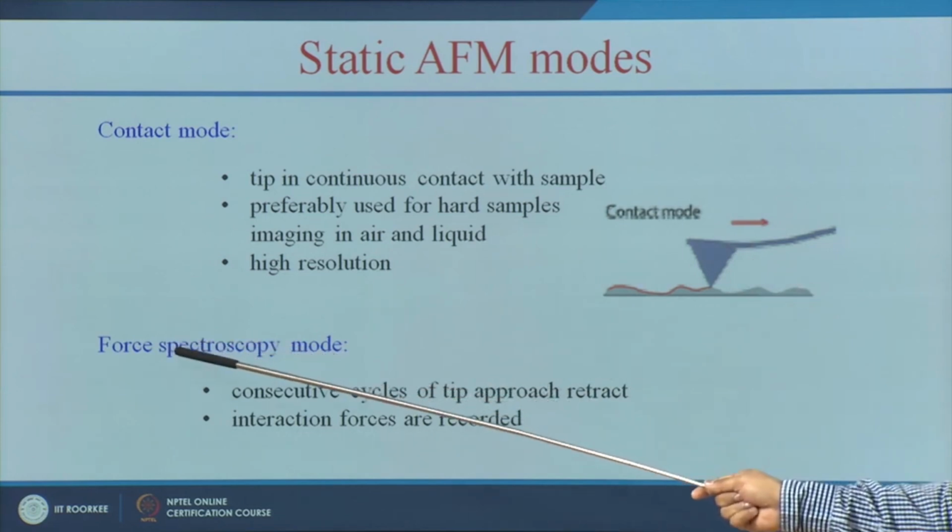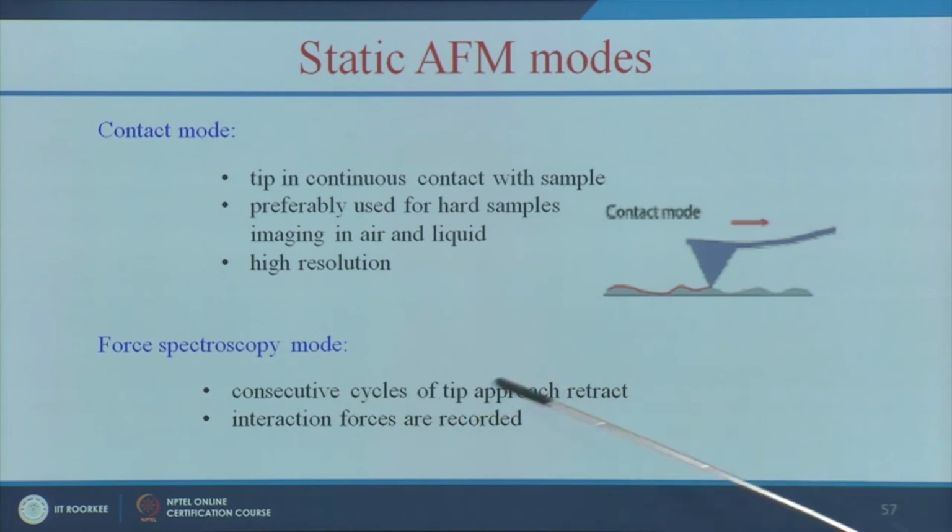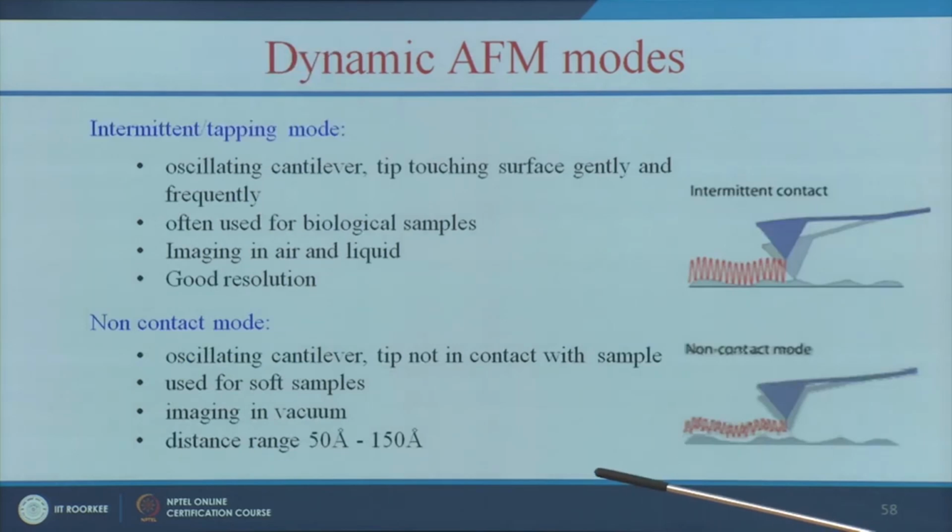Next one is force spectroscopy mode. Here the consecutive cycles of tip approach and retract, and here we can measure the interaction forces, okay.